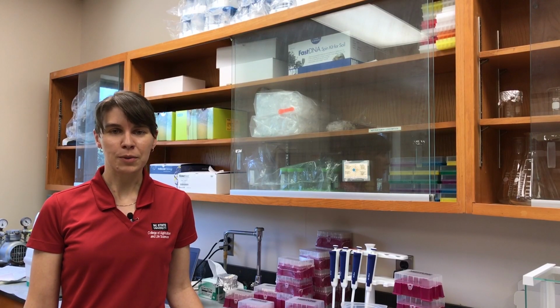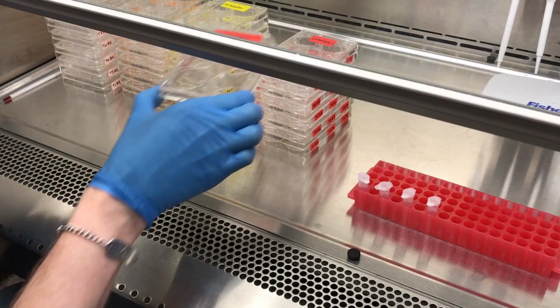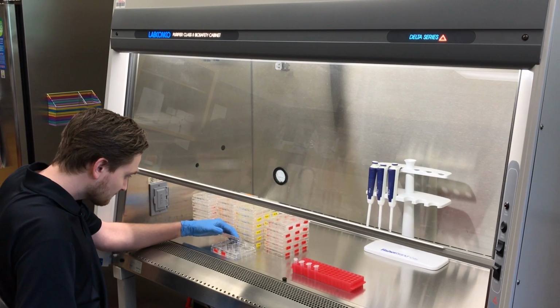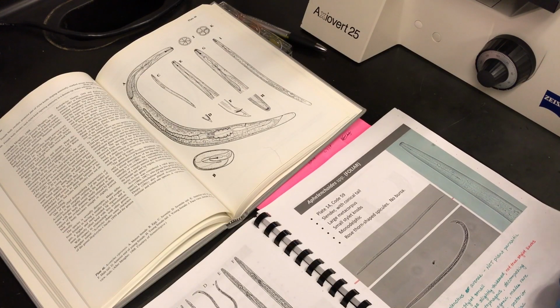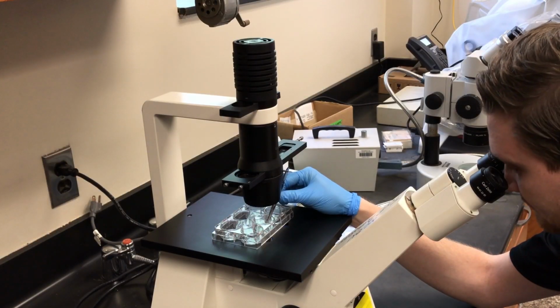Once done in the thermocycler, we take the mixture and place it into a gel-like substance and illuminate it with a black light. As you can see here, these lighted bands indicate the presence of ME. As you can see, identifying ME can be a tricky task, even for experienced scientists and nematologists. But it's still very important to distinguish ME from other root knot nematode species.